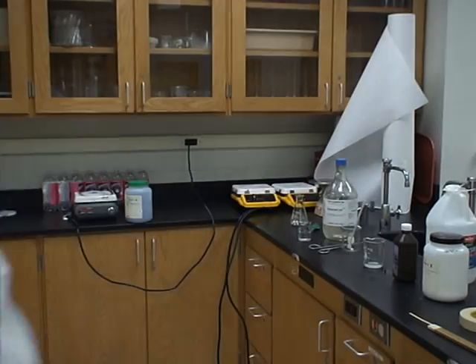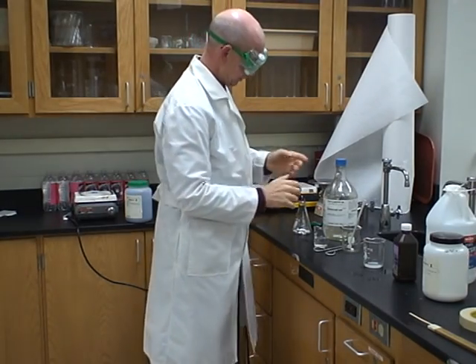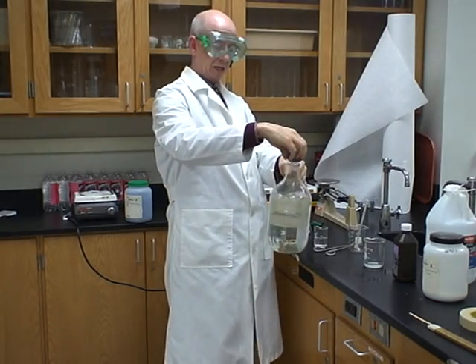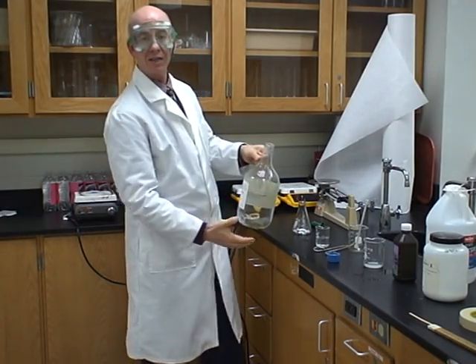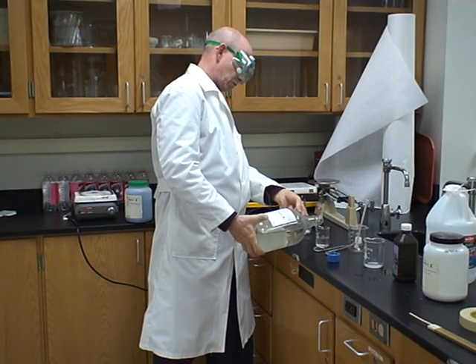Now we're going to do one that's a little more dangerous. So before we do it, I need to get some goggles. The next change we're going to do is we're going to mix some acid here. I have some hydrochloric acid, which is very strong. Probably can't see it from there, but even when I open it, the smoke comes out. Nasty. I've got water here. And there's a saying: do as you oughta, add acid to water. So we're going to add a little bit of acid to the water.